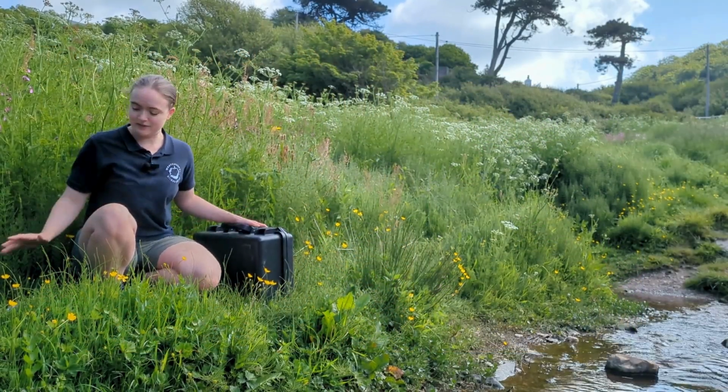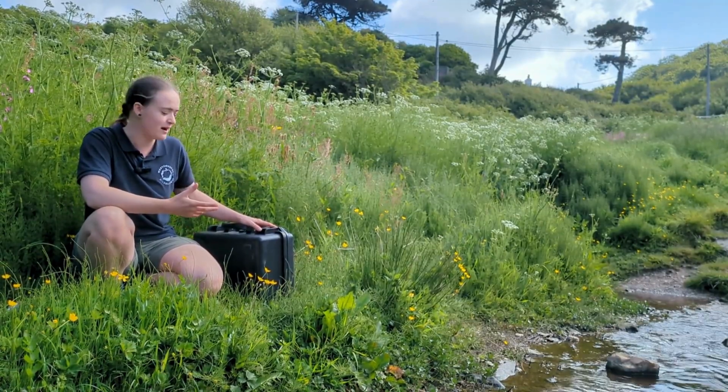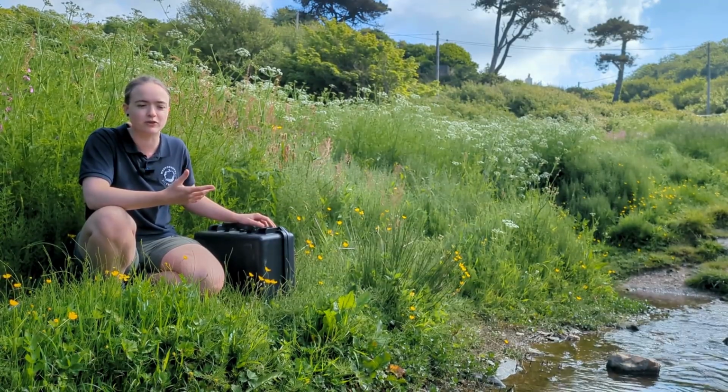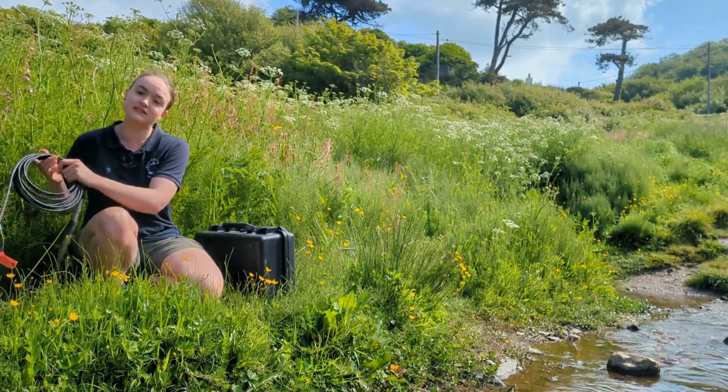I've got a few bits of kit with me here today. So we've first off got the black box. This is what we use to go out and monitor water quality. It's really good because we can go and we can take a grab sample and test it there and then and get results back. Alternatively, we can also measure water quality continuously.